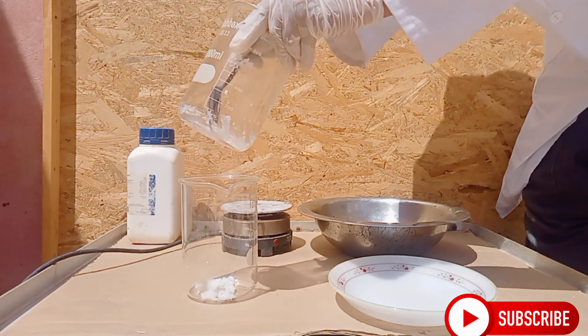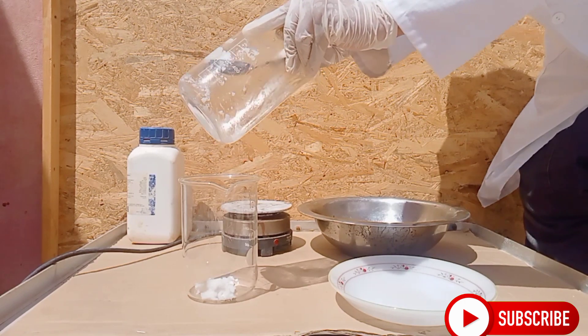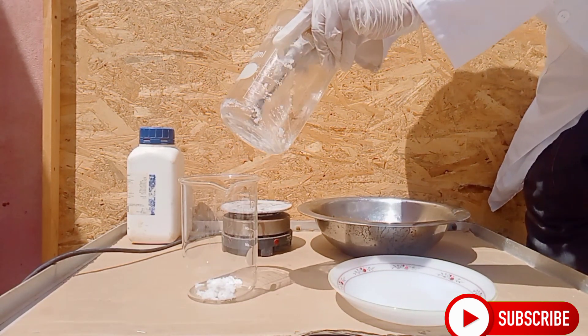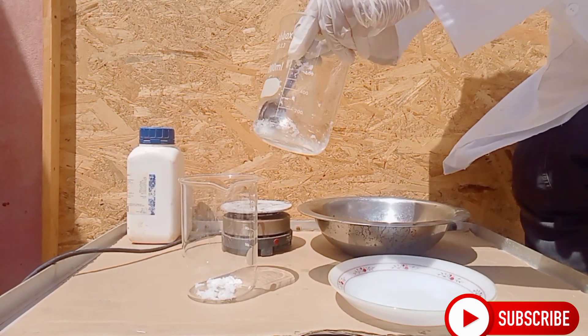After 4 hours of heating I got better results. Transfer the sodium chlorate to another cup, then put it in a bowl of water to cool. Thus, we get a good usable product.